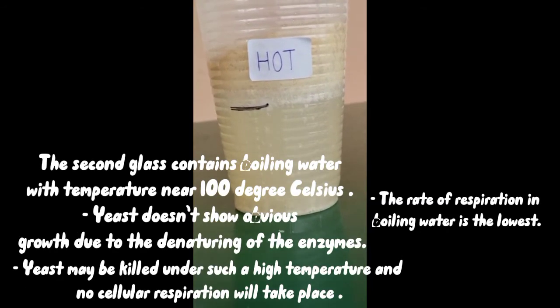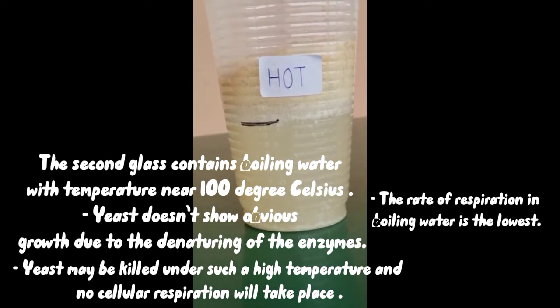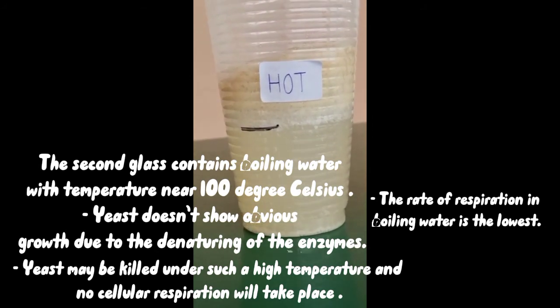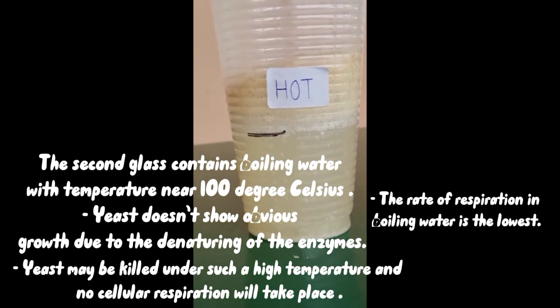The second glass contains boiling water with temperature near 100 degrees Celsius. Yeast doesn't show obvious growth due to the denaturing of the enzyme. Yeast may be killed under such high temperature and no cellular respiration will take place. The rate of respiration in boiling water is the lowest.